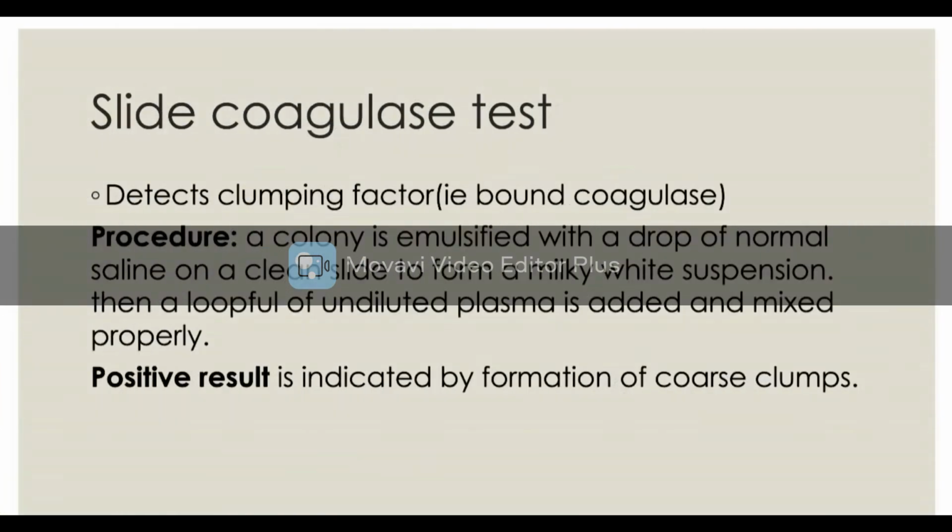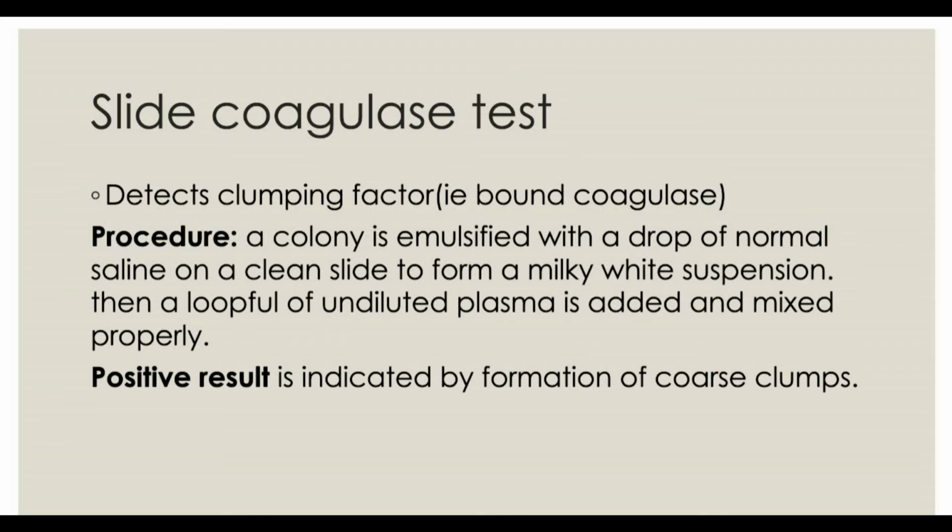Now for the slide coagulase test. The slide coagulase test detects the clumping factor, that is bound coagulase. In the previous one, it is free coagulase. In the slide coagulase test, it is bound coagulase that is detected.